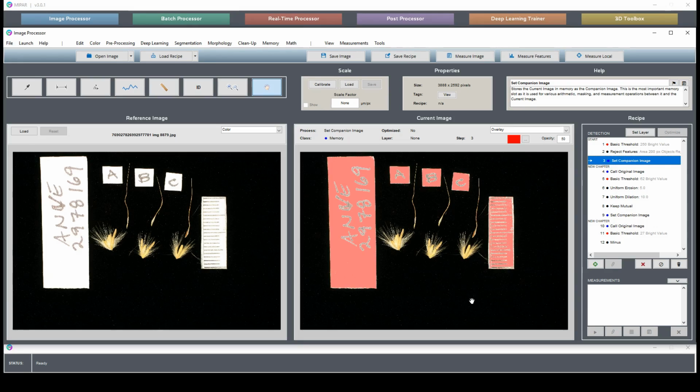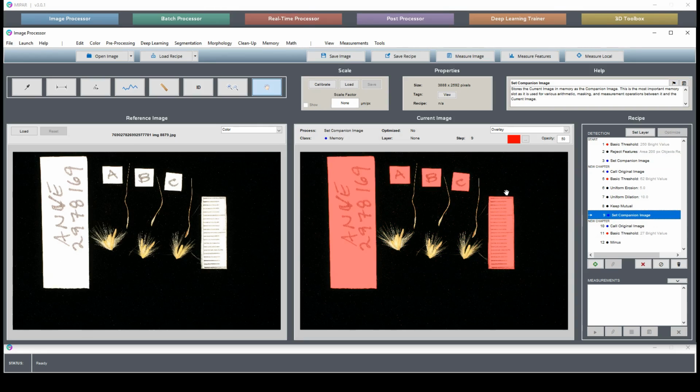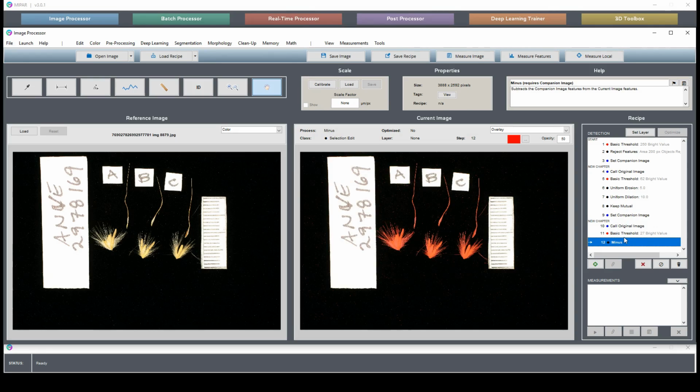You can do all sorts of tricks to try to get something that just touches only what you want to remove. And then you can use that to then get a better complete selection of the entire features that you want to remove. And then you can remove it.